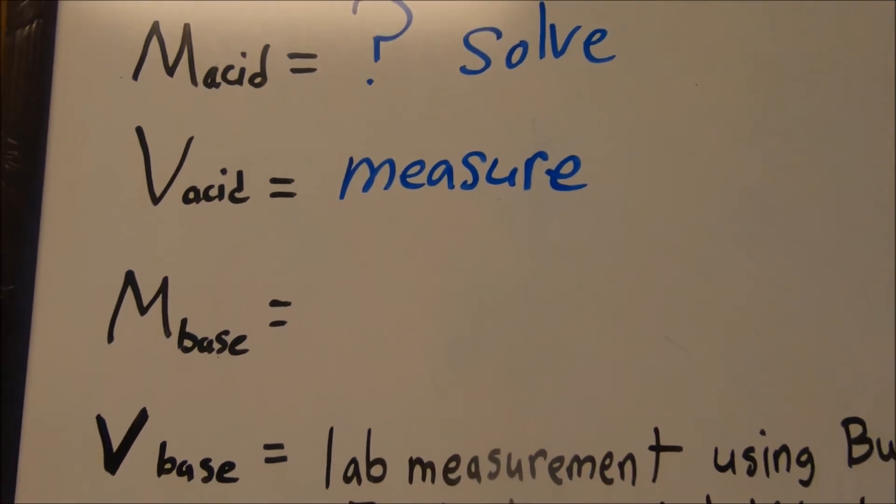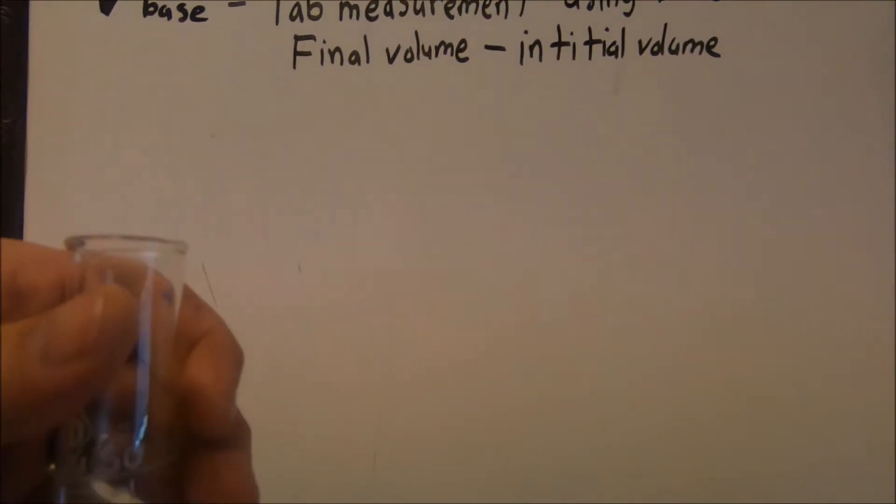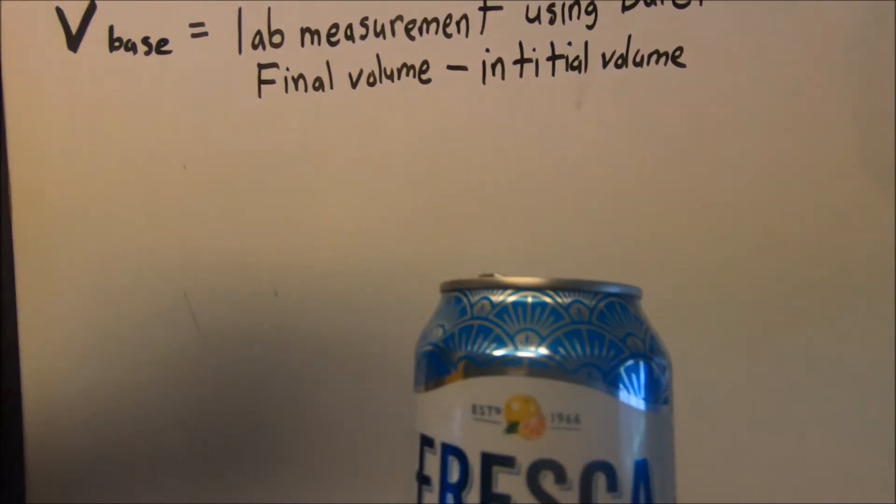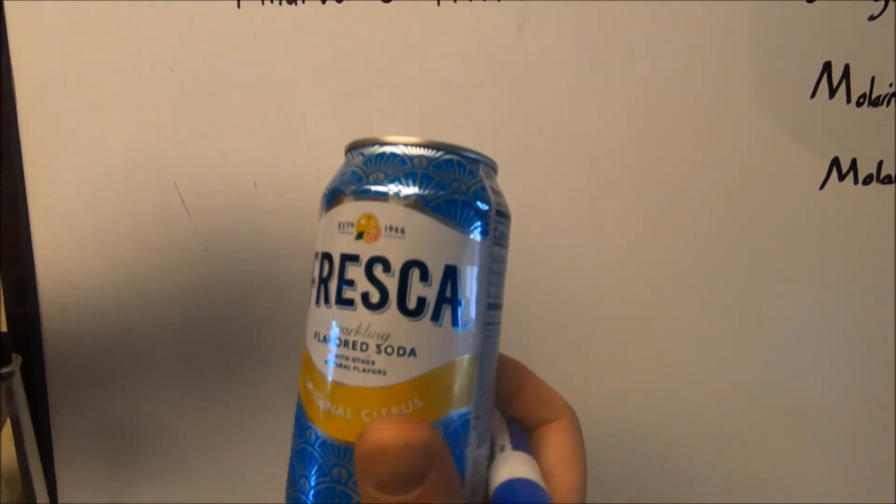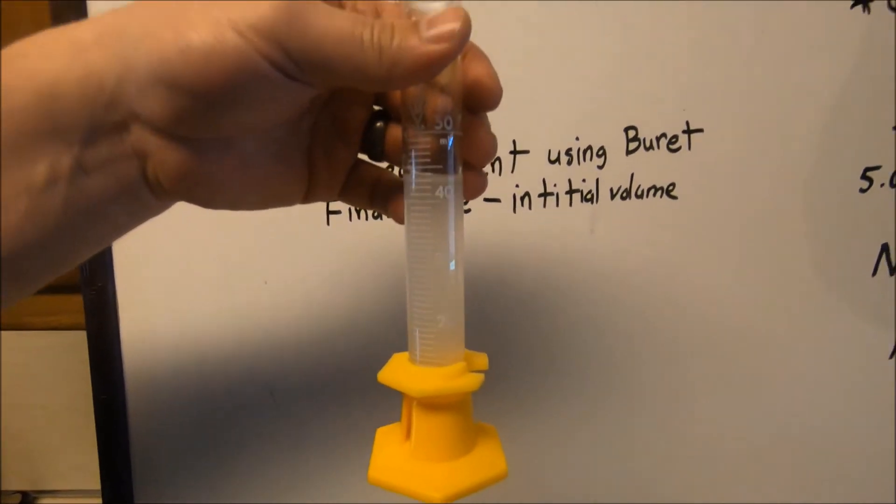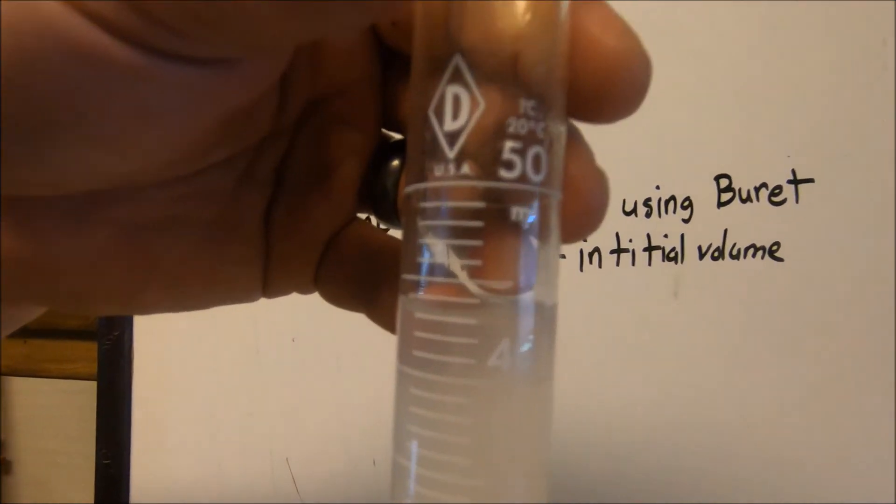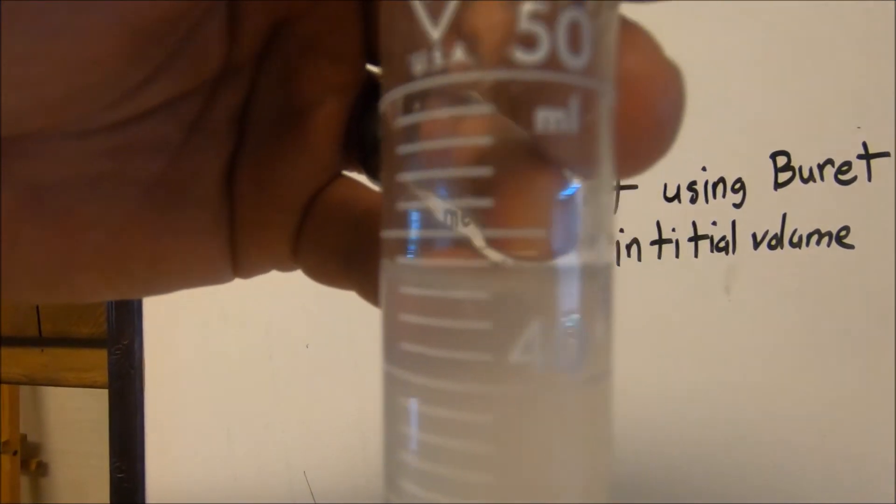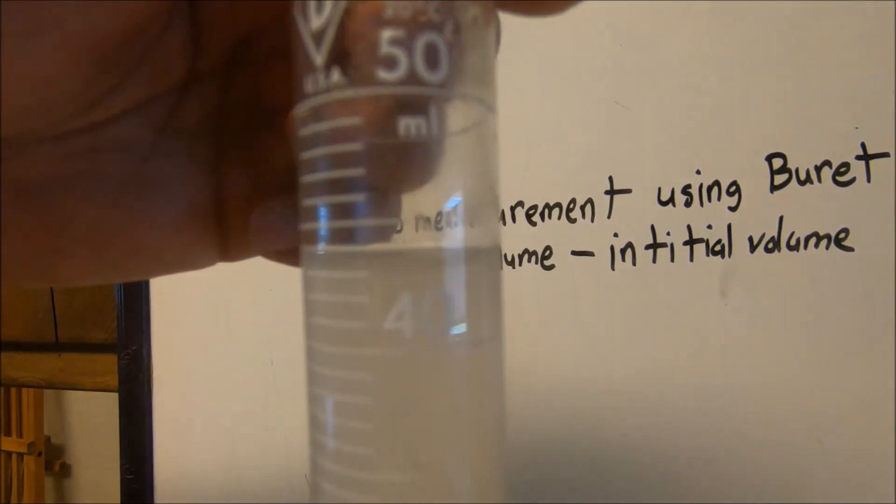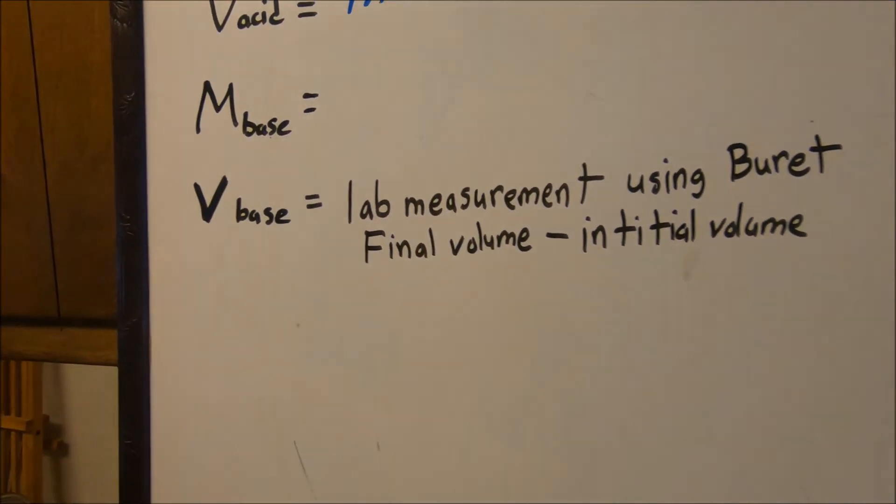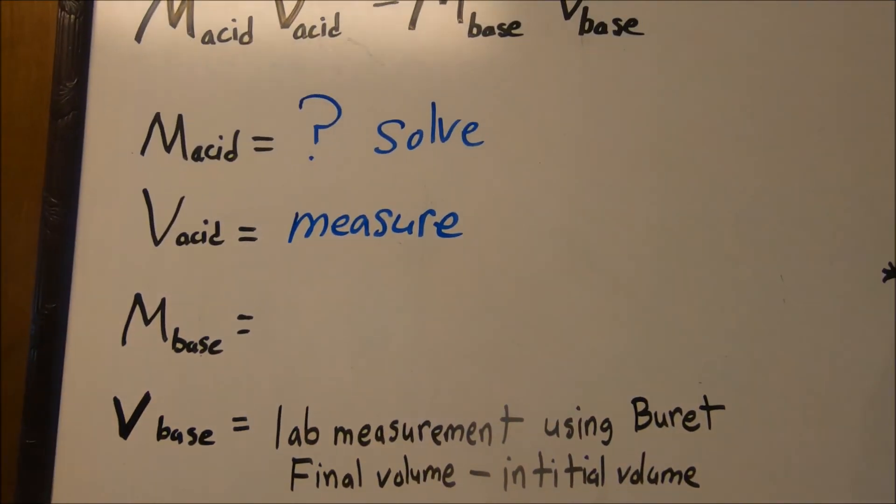To measure the volume of acid, what we've used is just some Fresca, and we've poured it into our graduated cylinder. Our volume is approximately just over 43, I'm going to say about 43.1 milliliters, so our volume of our acid.